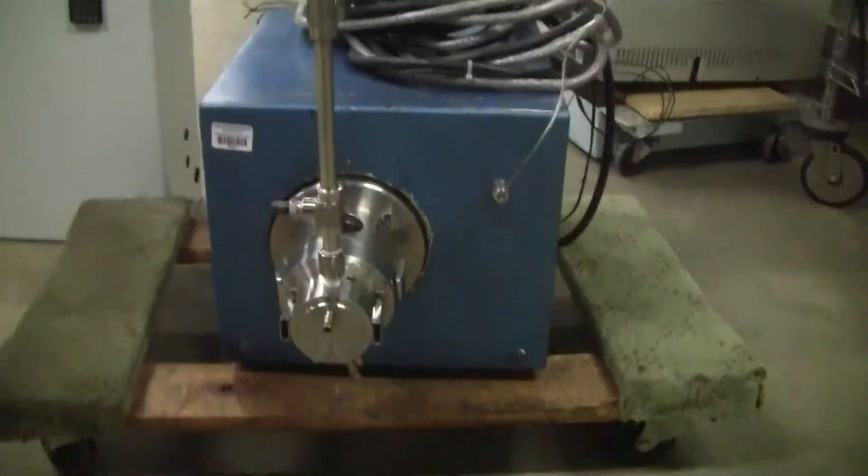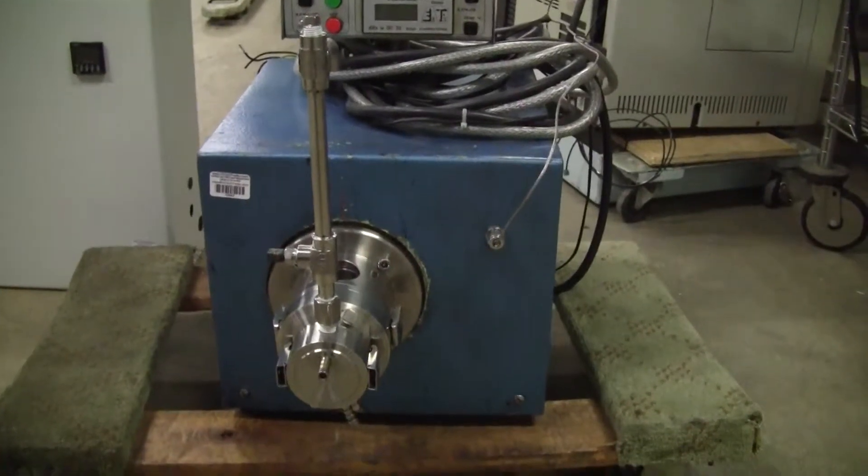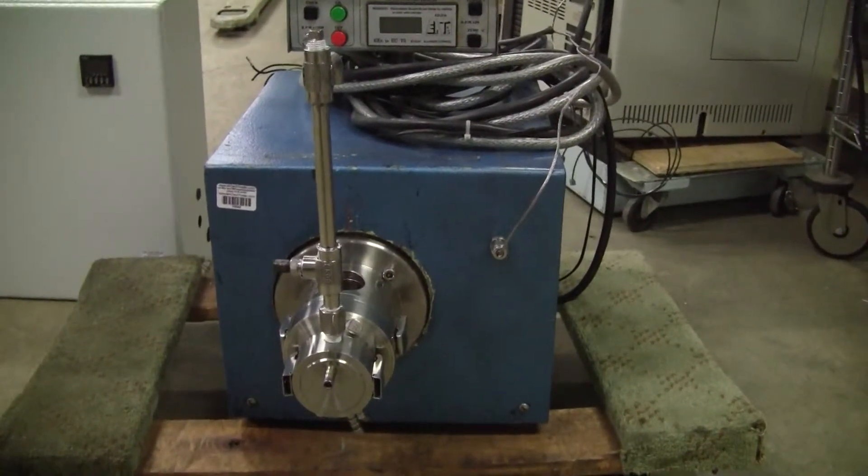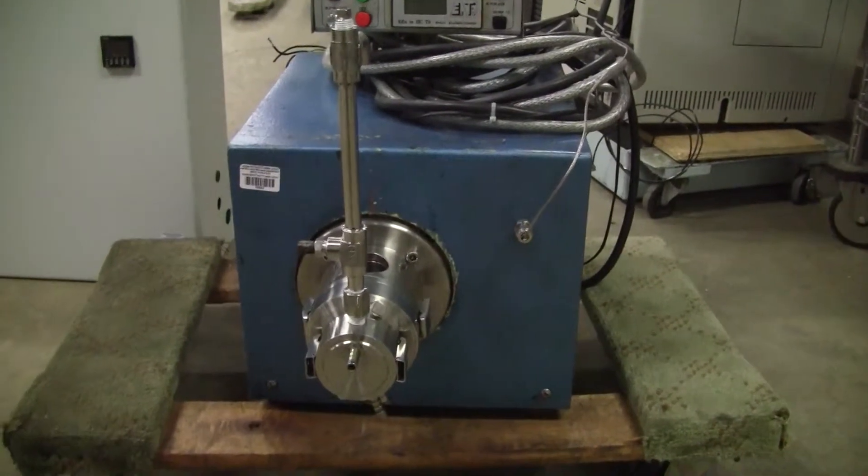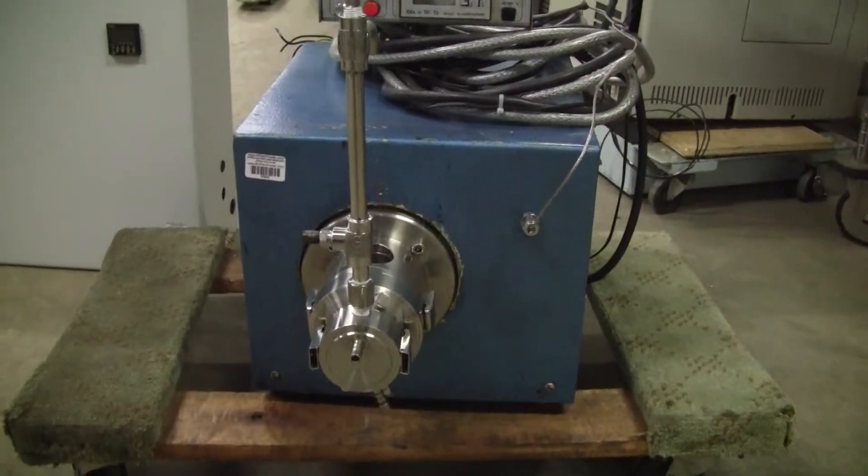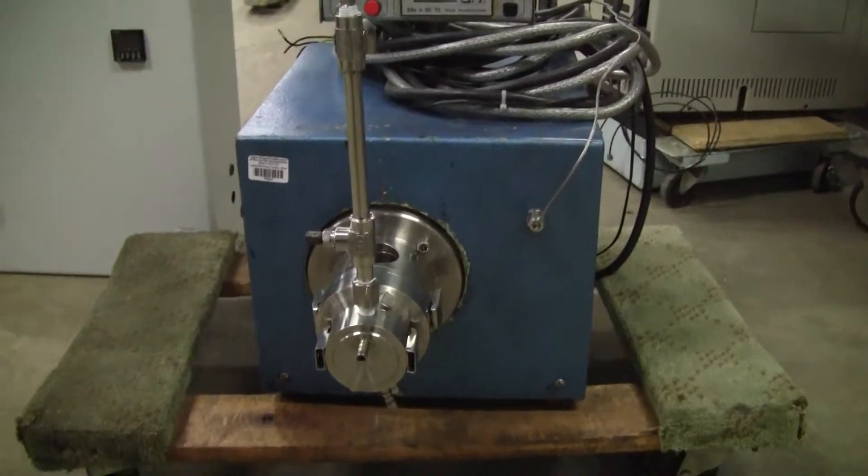It's stainless steel on the outside. Small self-contained agitator bead mill. Has a chamber of approximately 4 inches in diameter by 4 inches long. It's missing the top feed funnel.